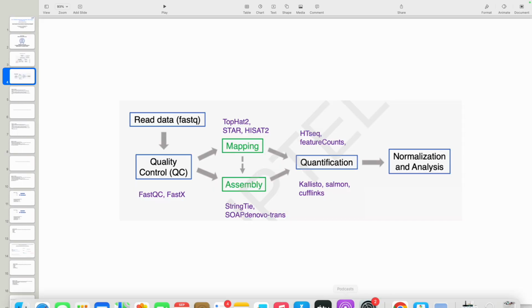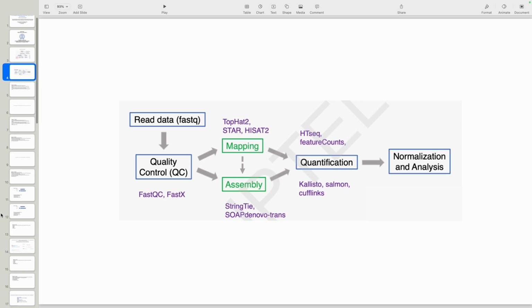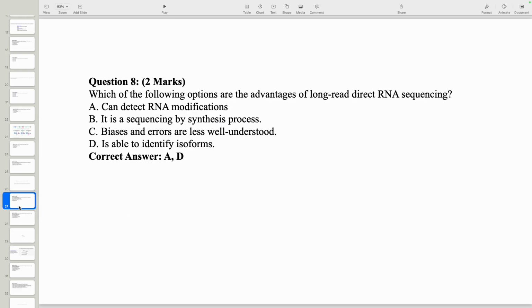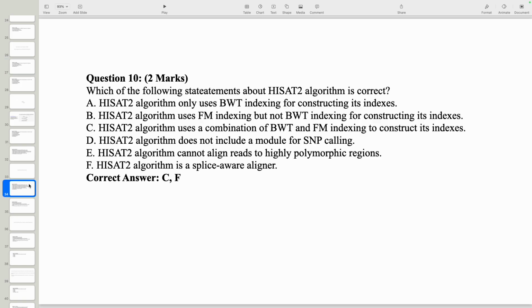So in the pipeline, what we are doing, we are quantifying our reads. We are doing the quantification of our reads against the genes of our genome of interest with the reference genome. So in this question, we are doing this quantification without the alignment of raw reads.